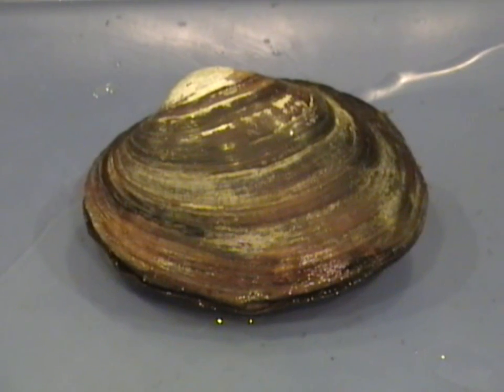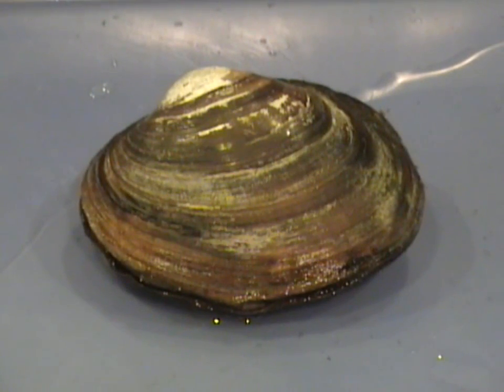Today we're going to run through a dissection of a bivalve. The type of bivalve we're using today is a freshwater American mussel.